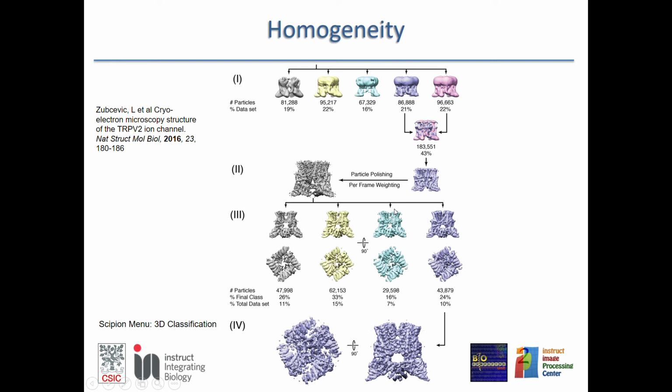But we should be aware that 3D classification is a very unstable process. If you run it once, you get something, so a particular image is assigned to this class. If you run it a second time, that same image is now assigned to a different class. That means the estimation of the class membership of that image is a parameter estimation, and there is so much noise that this parameter estimation is very, very noisy.